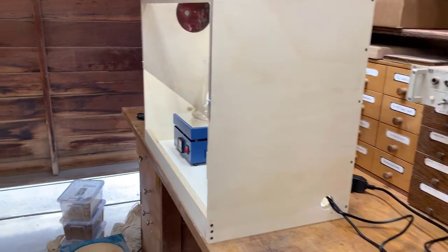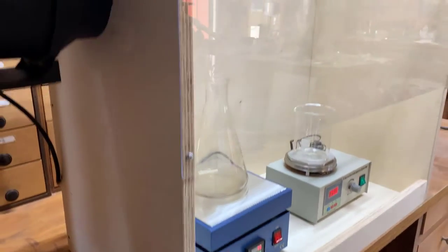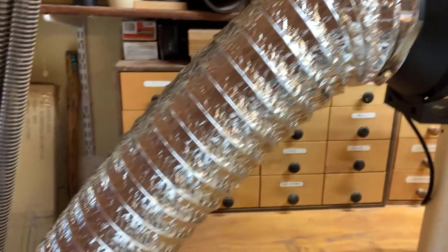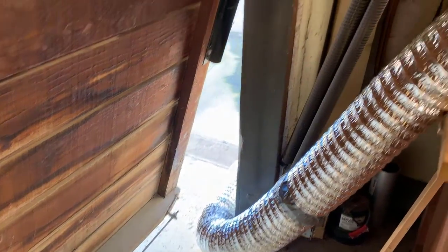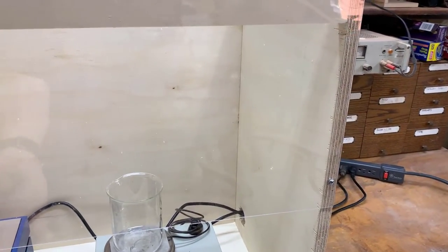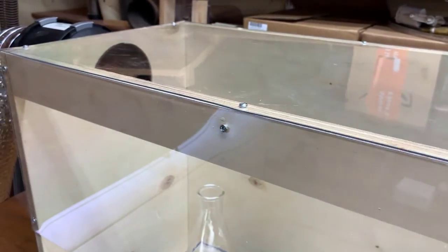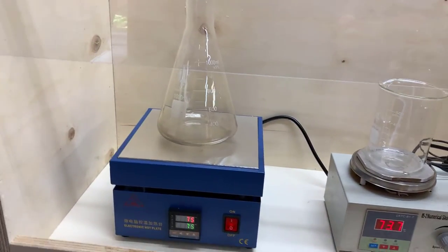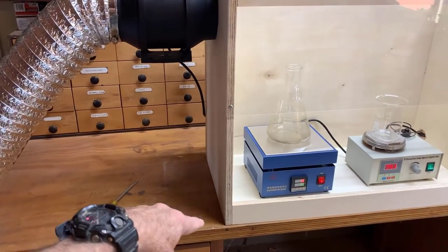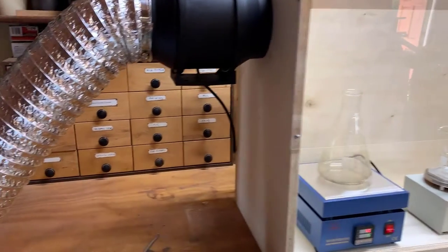Here's the fume hood. It's really simple. The design is just cheap three-quarter inch plywood. It uses a six-inch exhaust fan and some flexible ducting that goes outside of the garage. This is a sheet of 60 thou polycarbonate plastic — an inexpensive sheet on top that allows the light from overhead to get through. The dimensions of the box are 24 inches tall, 30 inches wide, and 16 inches deep.